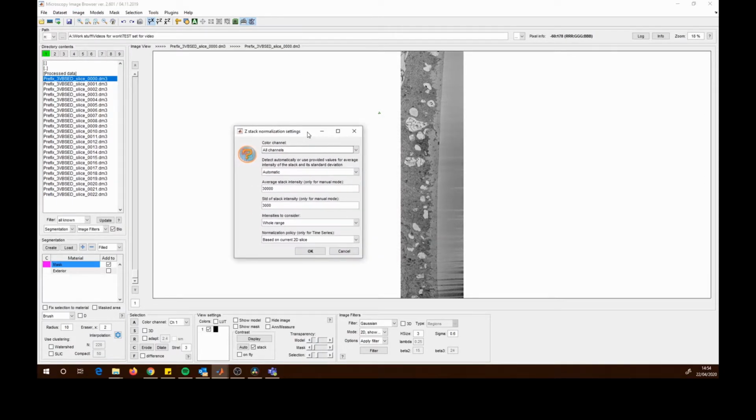So I would recommend doing this first on EM data, possibly on other data types as well, because when you do the alignment step later on, it adds border padding around the outside of the image, so it can move the image frame around inside of that. What that border padding then can do is affect the way the contrast normalization algorithms work. So I'm going to stick with the default settings for this for now.